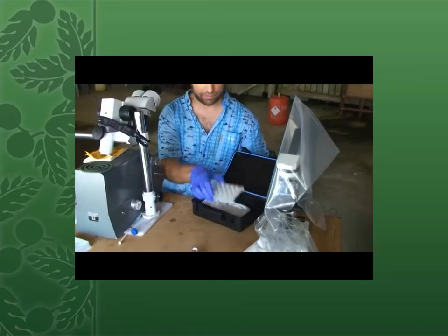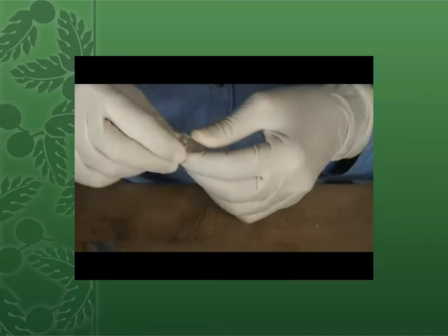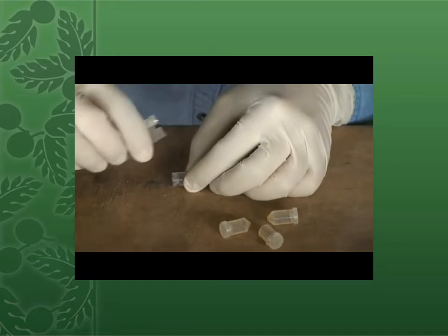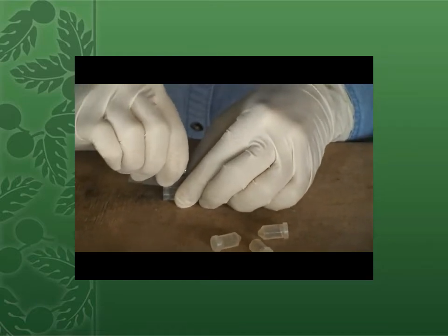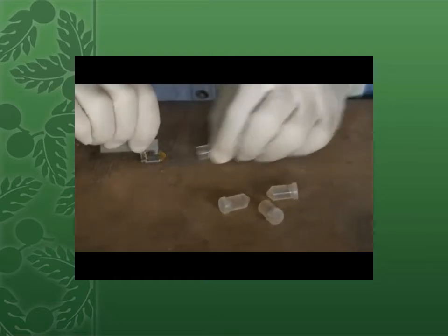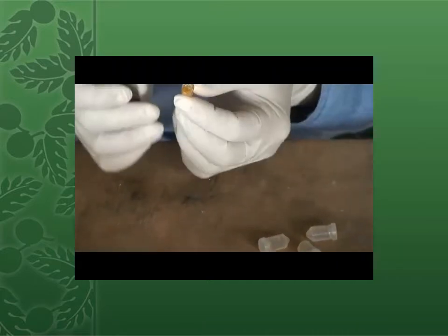Later, you'll take out the beam capsules and remove those stubs containing both your tissue section and the specimen label. Now you can see you'll be doing that with a single-edged razor blade, so use extreme caution so you don't hurt yourself. When the stub's out, you can just place it loose into the desiccating chamber again.